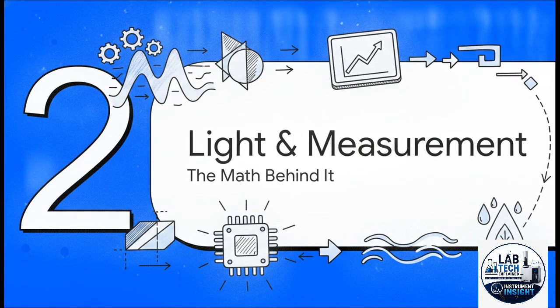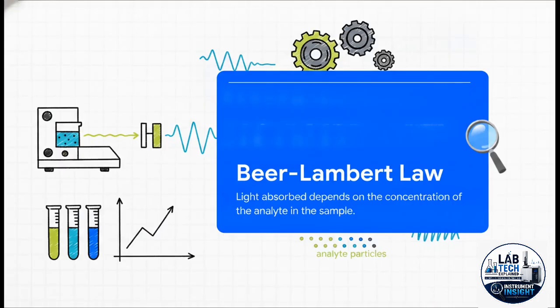Moving right along to Section 2, Light, Math, and Measurement. Time to get into the core physics behind the magic. Okay, so how exactly does the microprocessor know what number to spit out on the display? Well, for that, we rely on the Beer-Lambert Law. Now, don't let the name intimidate you. It's actually beautifully simple. A equals epsilon times B times C.